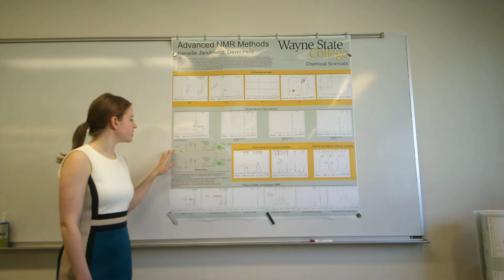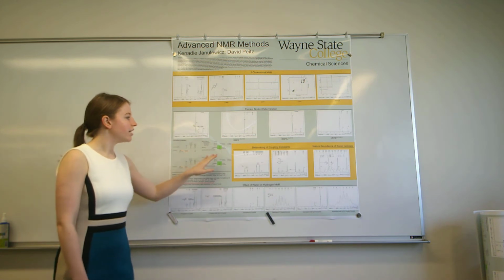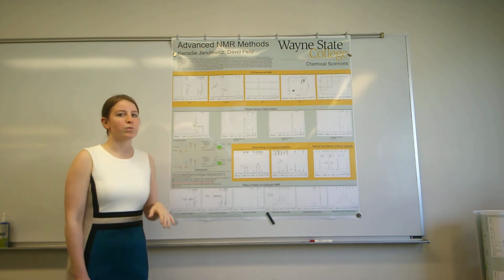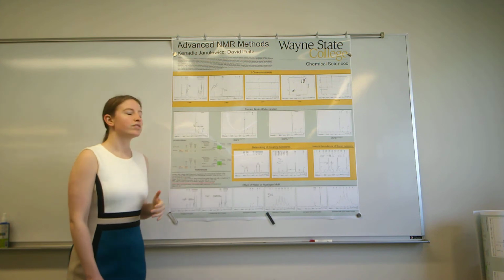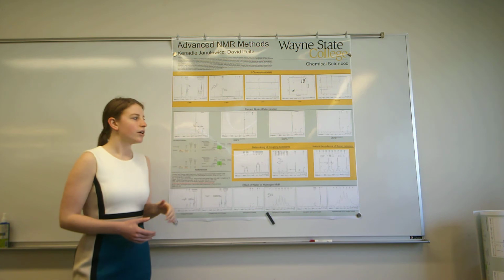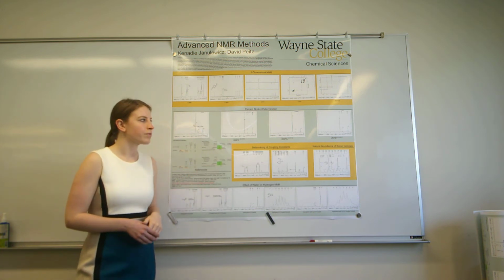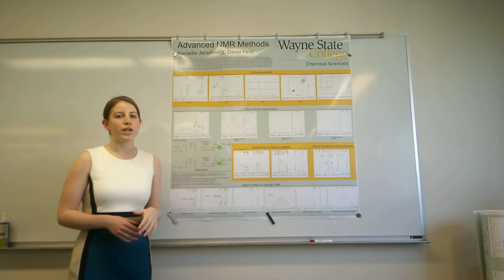We used a standard that was 35.2% by weight to check these calculations, and we came out with 32.4, which is close. However, since most alcoholic beverages are sold by percent volume, we went ahead and used our density to get 39.8% by volume. We applied these calculations to a variety of alcohols.